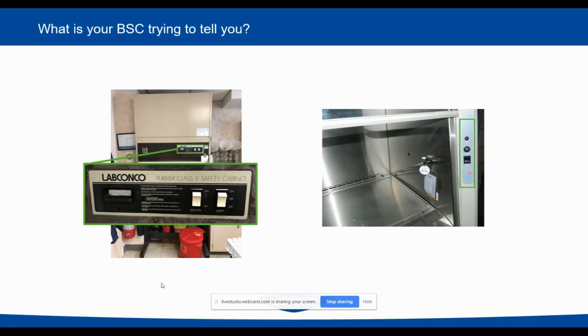On the left, you've got on and off buttons for the blower and the light, and then there's also a small gauge, a Magnehelic gauge, as it sometimes is called, and that shows the static pressure buildup of the biosafety cabinet's filters as particulates from work and the environment load. And that is the status indication of the performance of the biosafety cabinet.